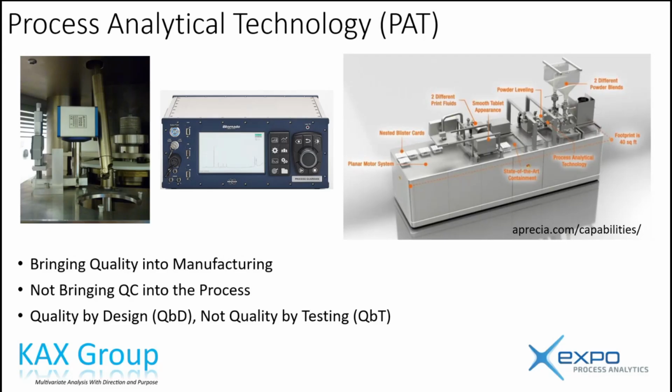Okay, so now we've got NIR, we've got Raman. Raman was the poor cousin of NIR for many years. During the day, everybody was using an NIR, like the Big Foss. Does anybody remember the Big Foss XDS in the refrigerated cabinet? And if you just rocked it like that, the spectrum would go.